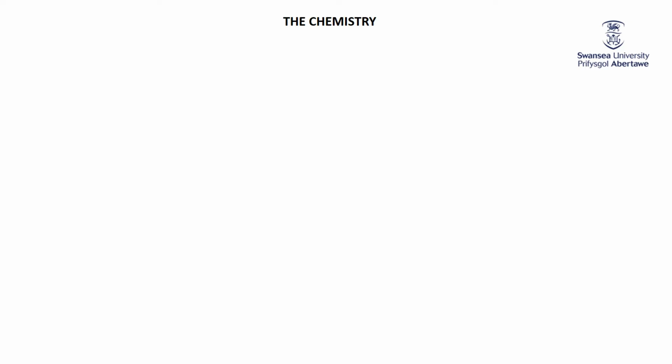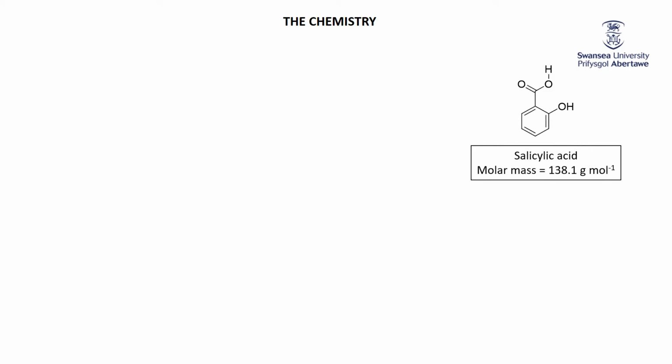Let's actually look at the chemistry associated with this. I'm going to start with the compound salicylic acid. That's what we're going to use in the lab. We're going to measure out a certain amount of salicylic acid. We're going to put it in solution.